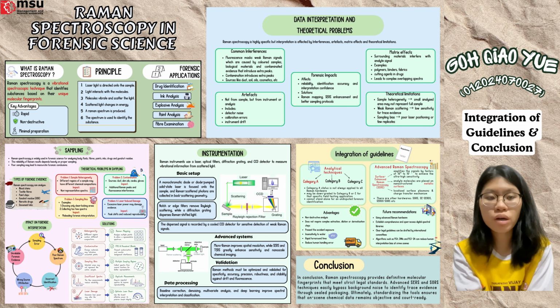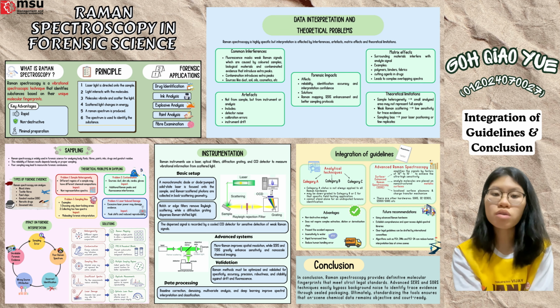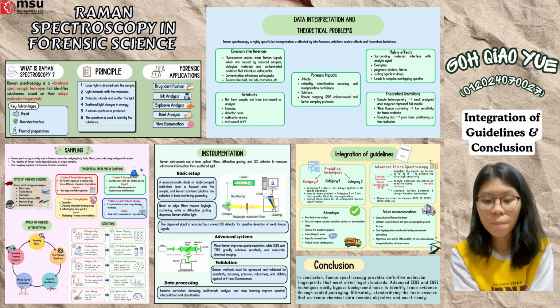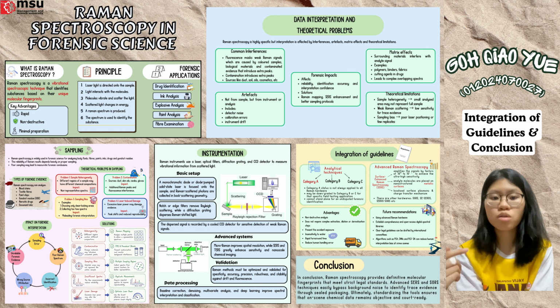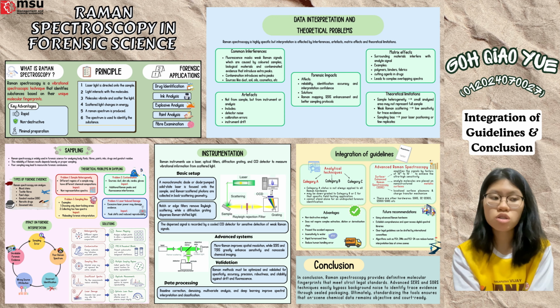To overcome physical barriers like weak inelastic scattering or matrix fluorescence, there is advanced Raman hardware that is used, which are SERS, SORS, SERDS, and so on. Here in the poster, I mentioned SERS, which stands for Surface Enhanced Raman Spectroscopy. It has two key phenomena, which are the electromagnetic enhancement, which creates a localized electric field, while the other one is chemical enhancement, in which charge transfer mechanisms occur.